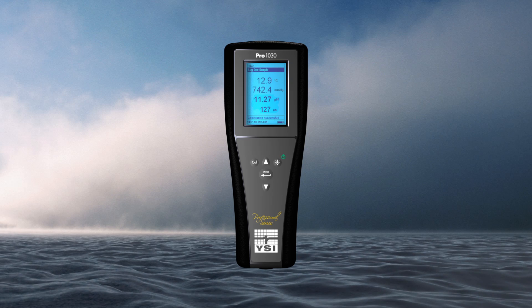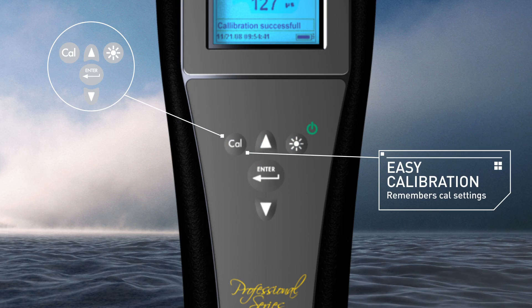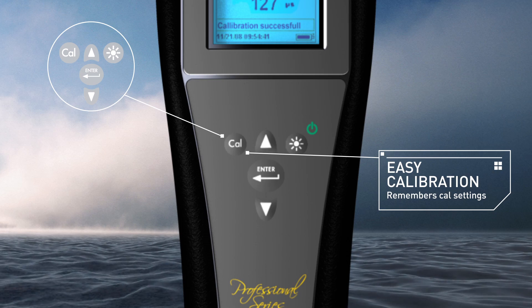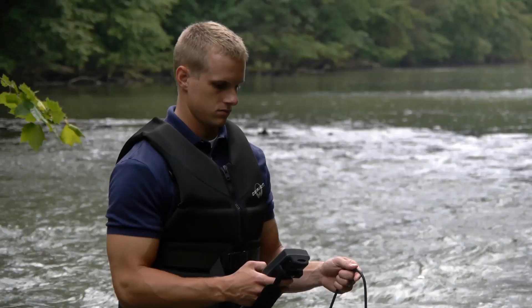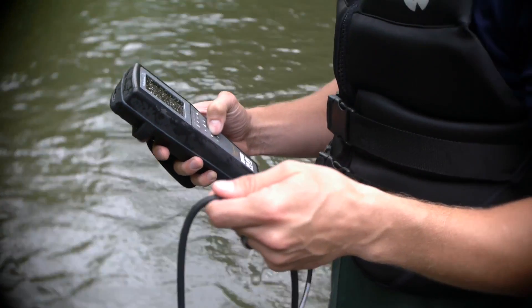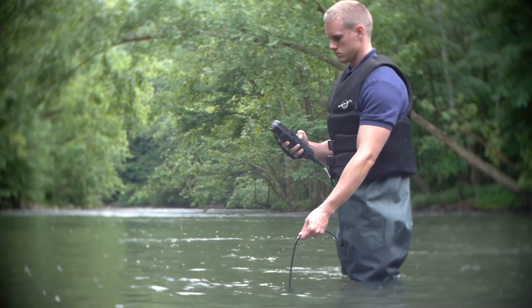Additional features include a Smart calibration routine that allows easy calibrations with the press of a button, remembers previous calibration values, and simply walks you through the calibration. Stores 50 data sets, graphic backlit display, and glow-in-the-dark keypad.